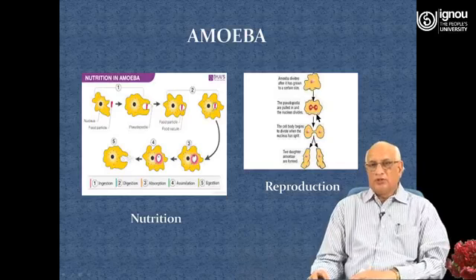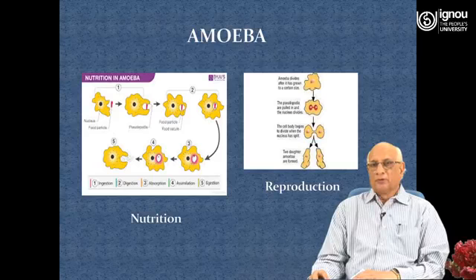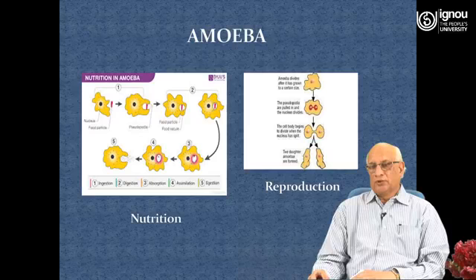If this 4th slide is placed for your study, then you need not write comments on the structure of the amoeba, because this slide shows the specific condition of this microscopic animal, the reproductive stage, when it is dividing into two parts. So whenever binary fission stages are shown in the slide, you should not write comments about the detailed structure of the animal. Just identify this as a slide of amoeba which is dividing, and this division is binary fission. Binary fission is in favorable conditions.